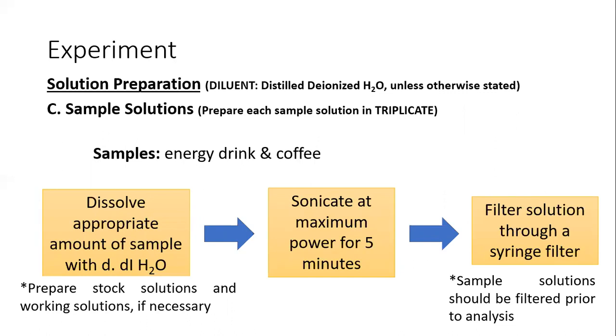So again, ang purpose ng sonication is to ensure na homogeneous yung sample niyo. Okay? Then after sonicating your samples, you can now filter it using a syringe filter.